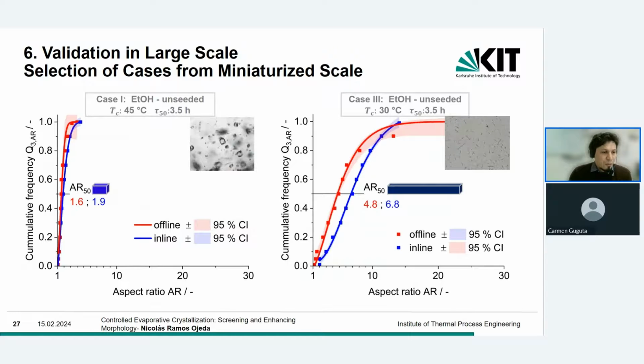It is a low aspect ratio, between 1.6 and 1.9. And in the other case, it is clearly a more rod-like, elongated crystal morphology.